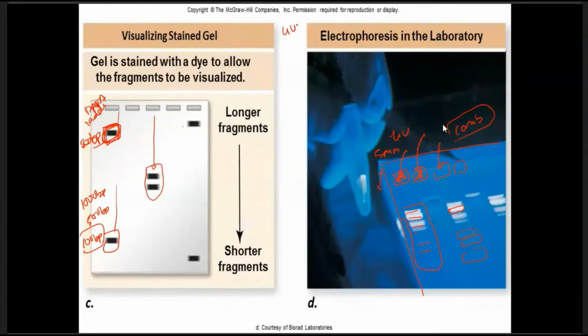So this is reaction 1, reaction 2, reaction 3. Earlier, reaction 1 produces a very short DNA fragment, so this is the very short fragment and this is the long fragment produced. Reaction 2 produces two medium size fragments, but notice that one is longer than the other. One is shorter, one is longer, although both are of medium size.